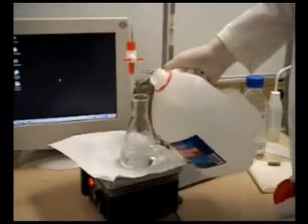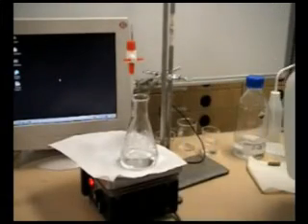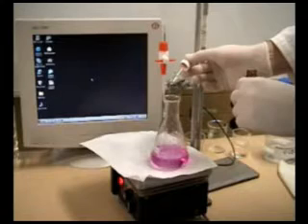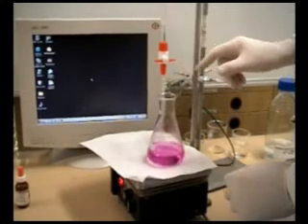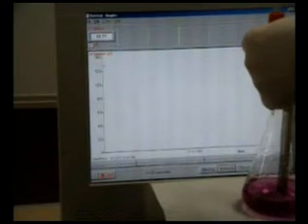The titration is now repeated. This time, the initial burette reading is recorded.